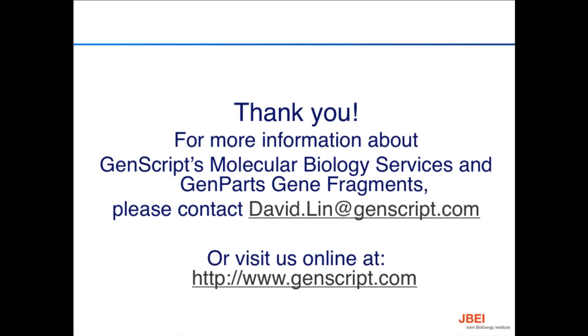And I think one of the really nice things that some of the companies are doing now is that they have very high concentration formats for their reagents, and especially if you're using things like the Labcyte Echo, some of these acoustic printers, having really high concentration reagent kits is really great, because then you can use more of the volume on your DNA assembly pieces as opposed to just the master mix. So that might be a decision for you too. But I think it's just the right tool for the right job, and maybe in your particular workflow or for your types of needs, one particular kit is going to work better for you. So I think it's great that we have lots of choices.